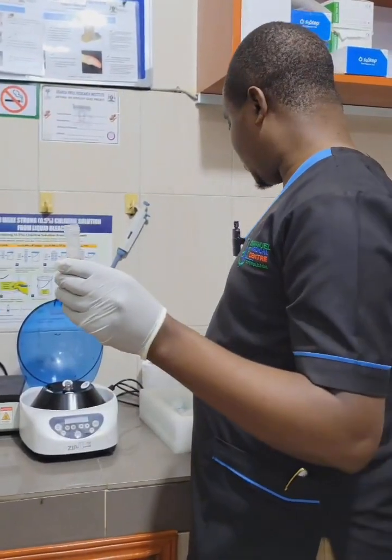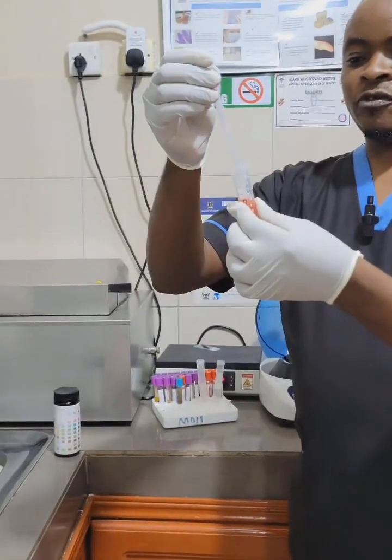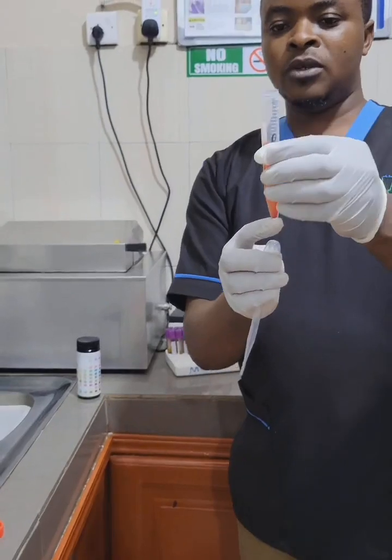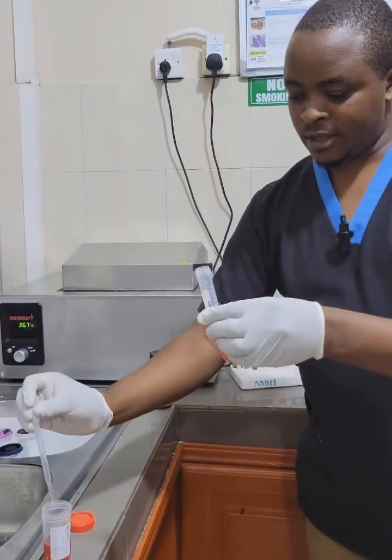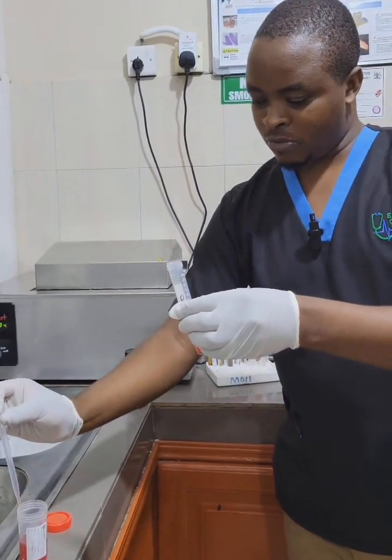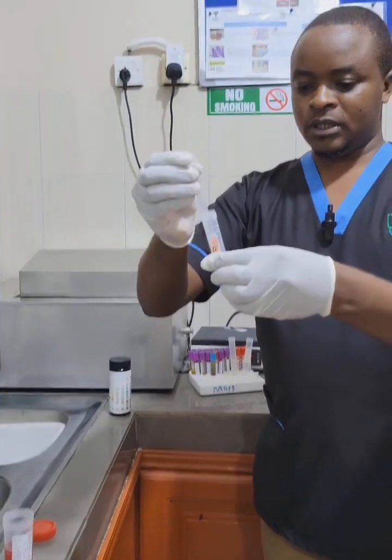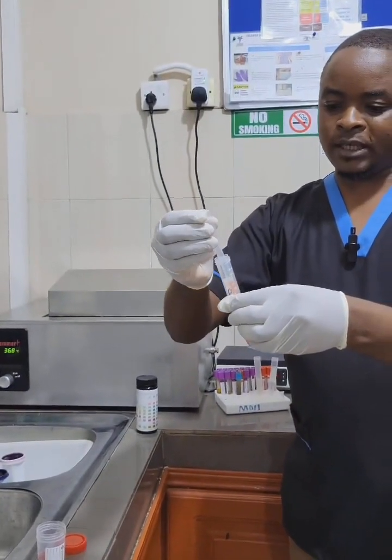So after removing it, using a pasteur pipette, we pipette off the supernatant, because after centrifuging, you obtain the supernatant with the sediment at the bottom. So using a pasteur pipette, you remove the supernatant without disturbing it. You remove gently all the supernatant. Some people prefer pouring it away, but the best method is pipetting off the supernatant without disturbing the sediment.